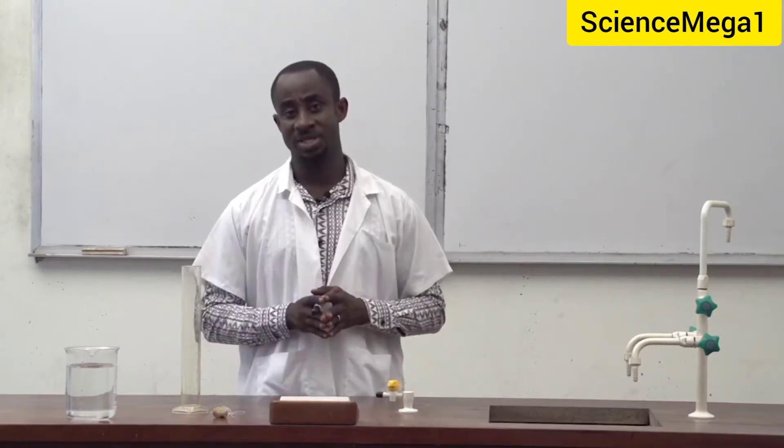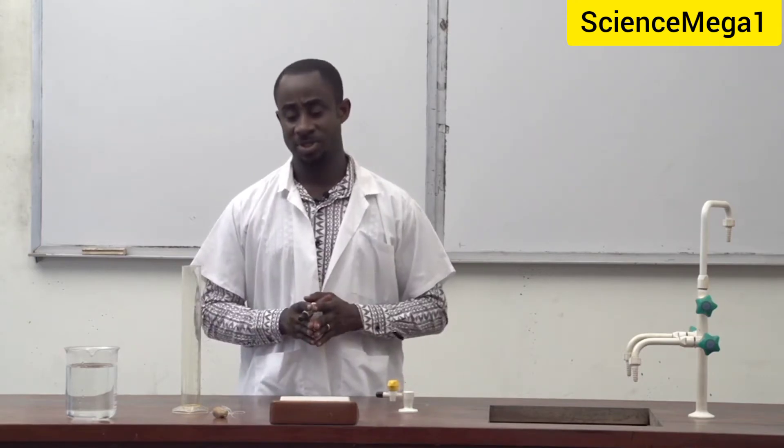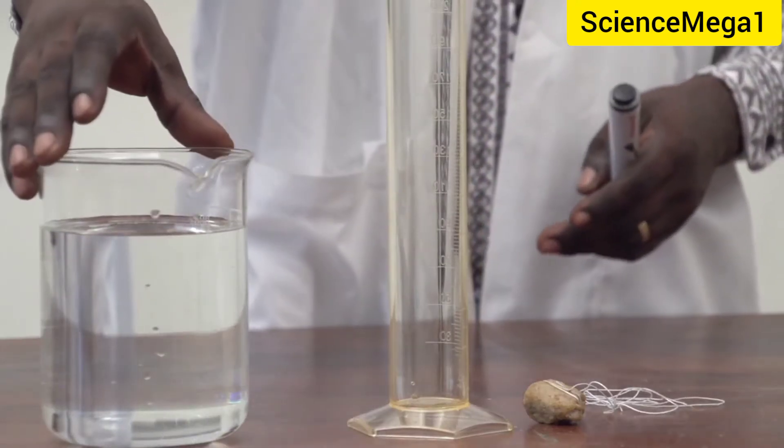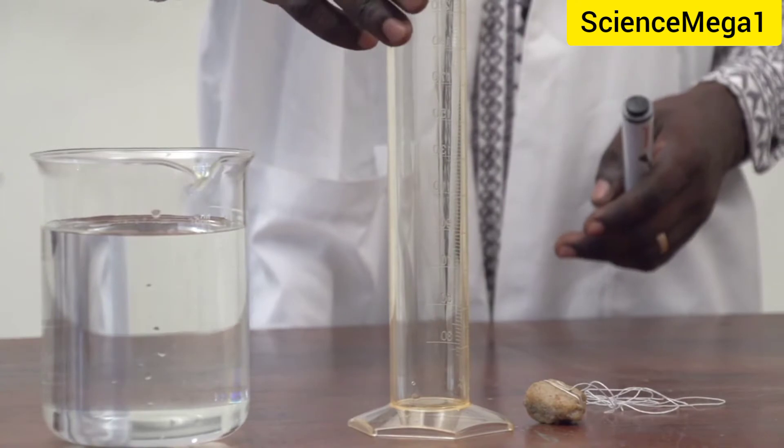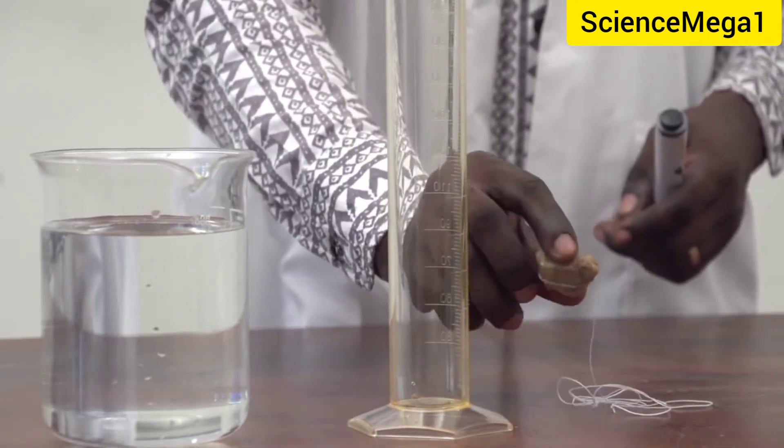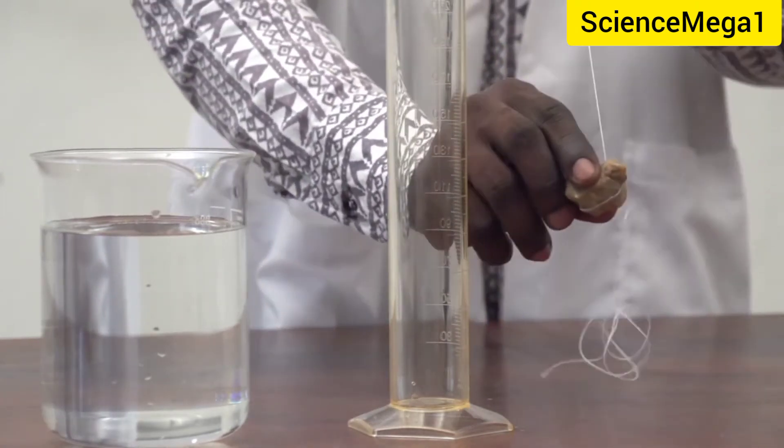To conduct this activity we need the following items. We have a beaker with water, we have a measuring cylinder, we have the irregular solid which is the stone tied with a thread or a string.